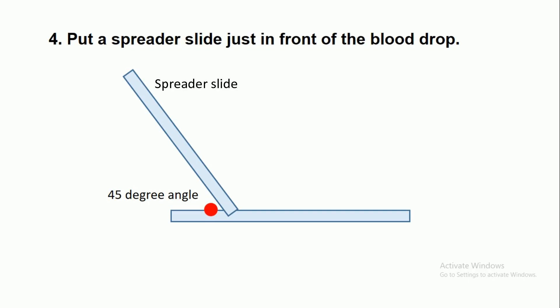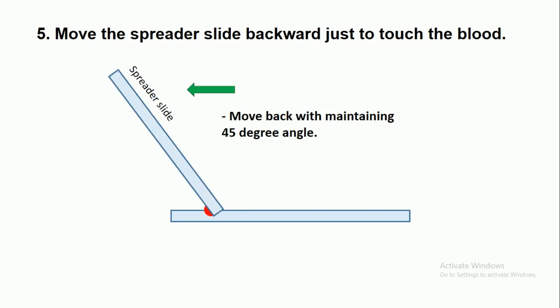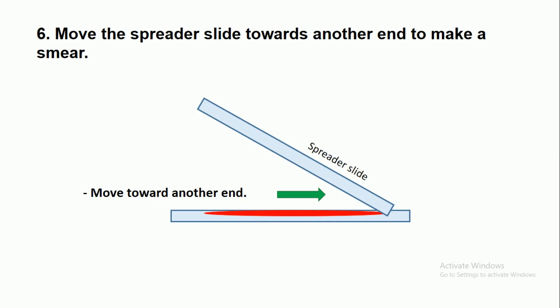Place a spreader slide just in front of the blood drop and maintain an angle of 45 degrees between the two slides. Move the spreader slide backward just to touch the blood and wait a few seconds so that the blood will evenly distribute across the whole edge of the spreader slide. Then move the spreader slide toward the other end to make the smear.